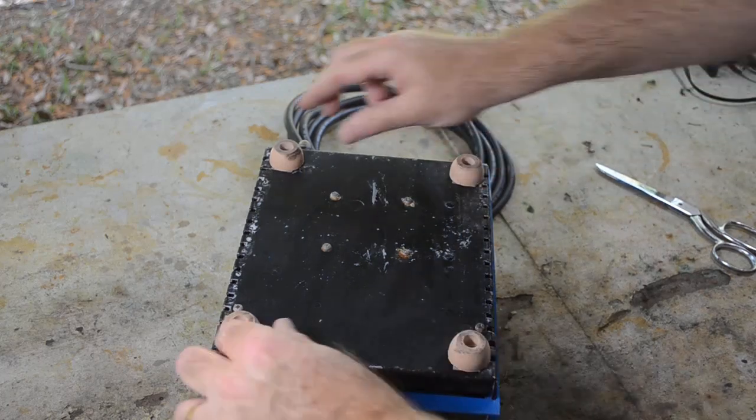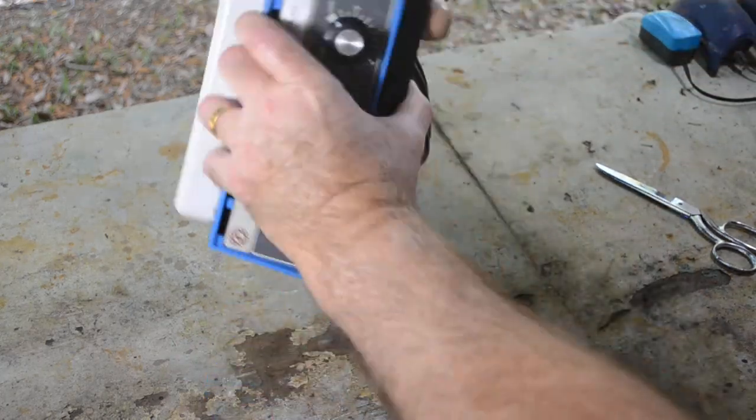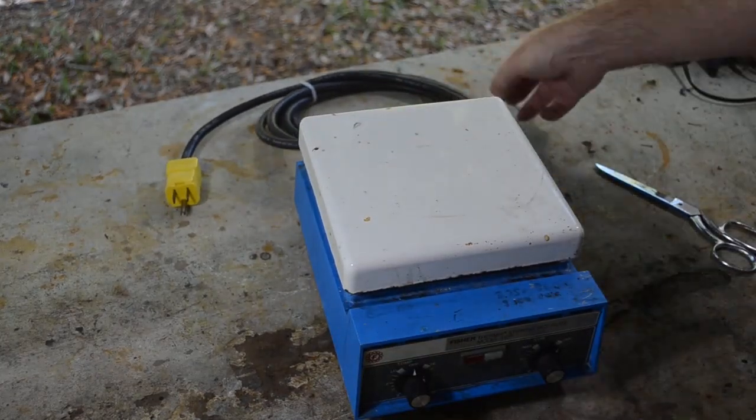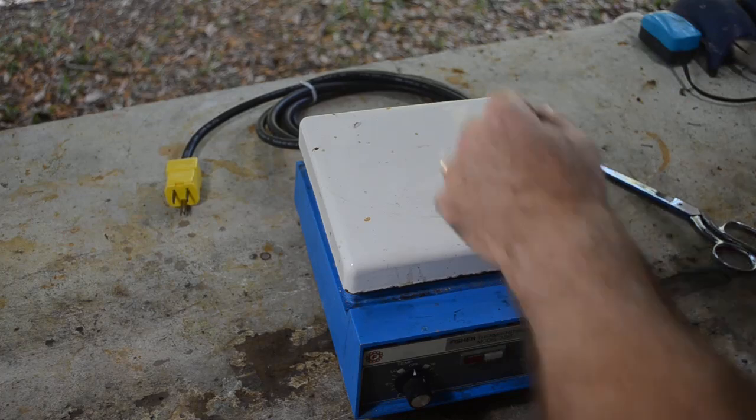Okay, there we go. All four feet are on. It doesn't rock. Nice — rock steady. Time to test this thing out.